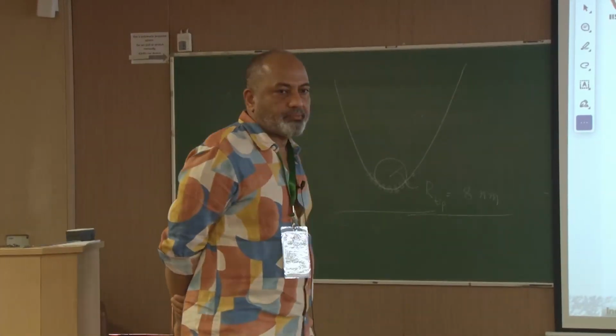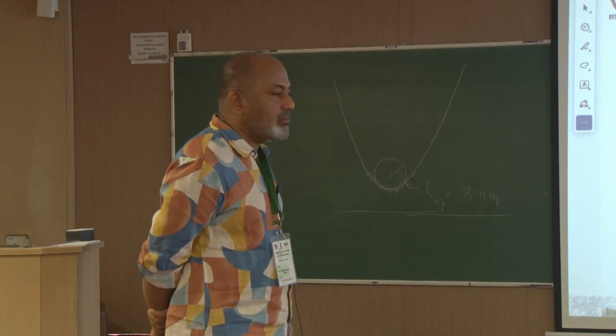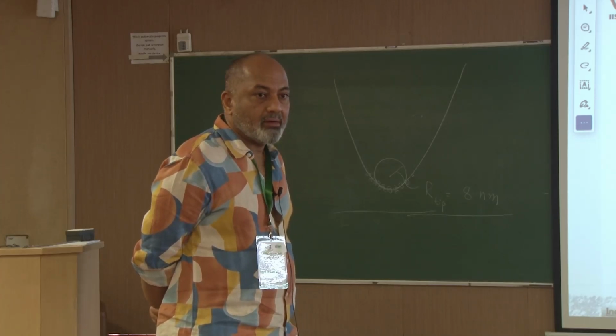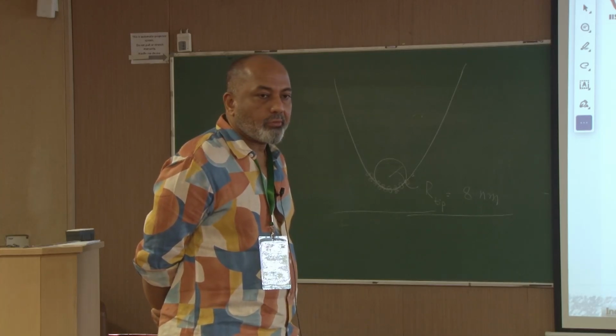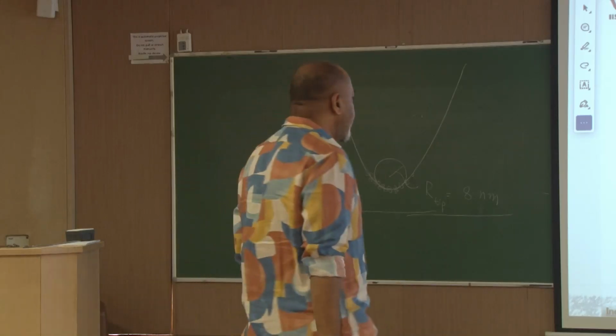So how does the force constant of two materials resonate? So the chip and the cantilever are a different material? No, same material. Given that it is made out of the same material and attached to that chip, the force constant should be towards the... Okay, I get your point.